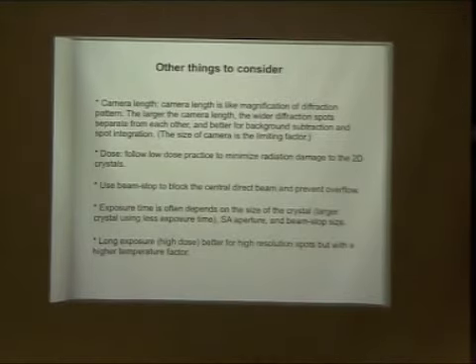One thing we found with the big crystals is that it's actually still better to just expose small areas, right? Because the larger the area you expose, the bigger the chance that you also get an imperfect crystal. Then your spots may not be as sharp as when you use a small aperture. So in that case, you either waste some of the crystal by not recording it, or you reduce your beam size and use a small aperture, making the size of the beam really similar to your aperture, so you can take multiple shots. Right? So that's another way.